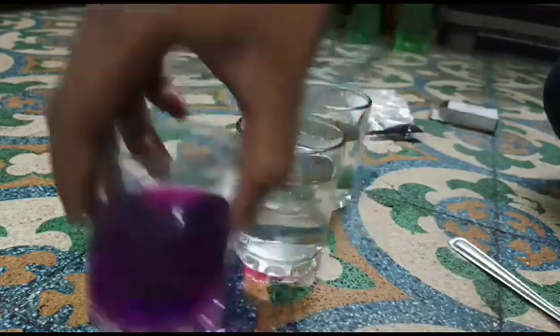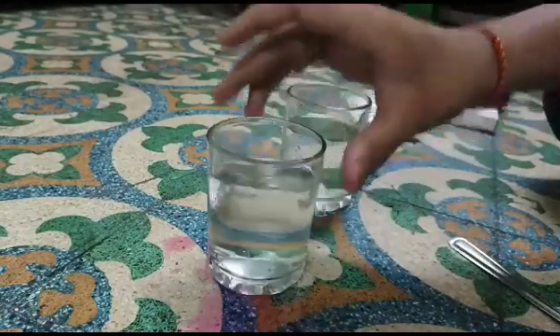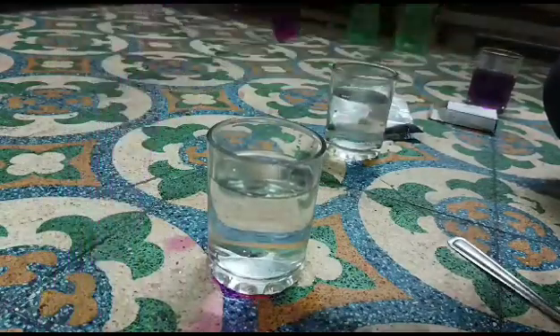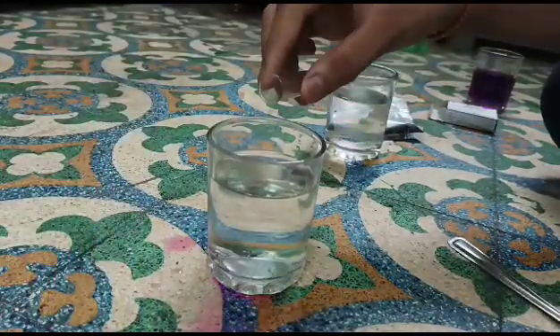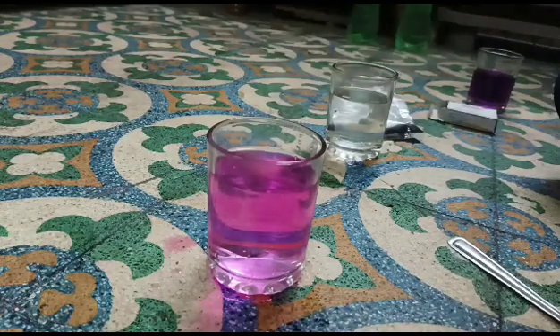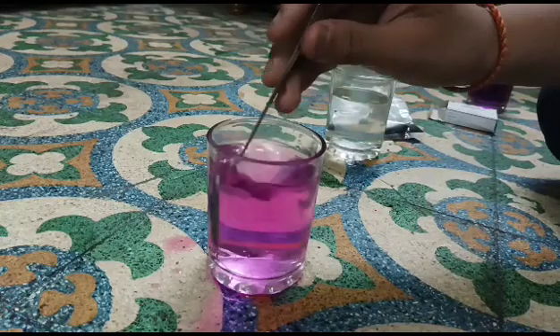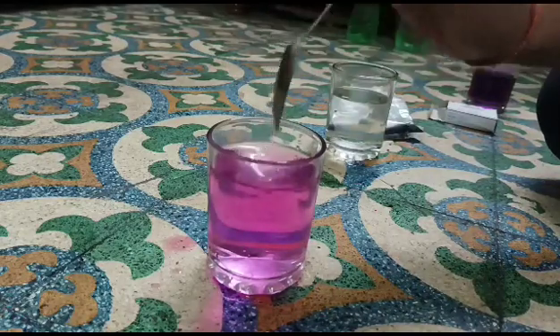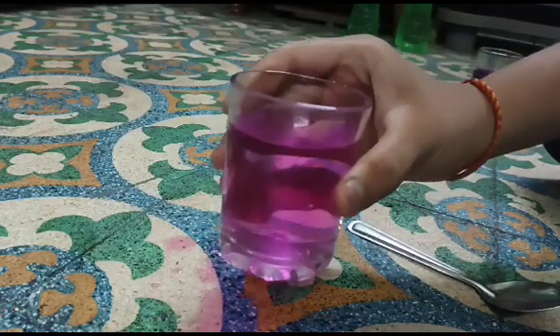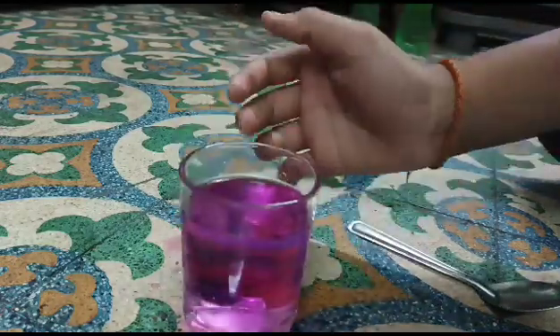Now pour this into another glass to know whether it will be the same as the first glass or not. Now you can see the differences. It is not equal to the first glass because the quantity of matter was more in the first glass and less in the second glass. Now we will do the same with the third glass.